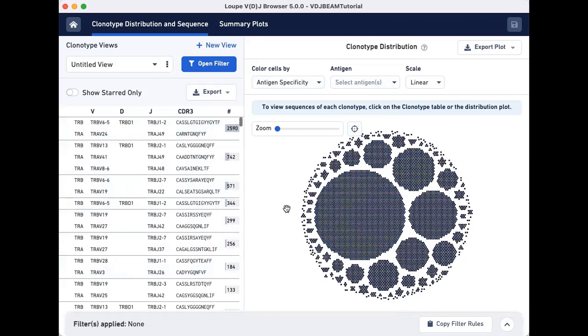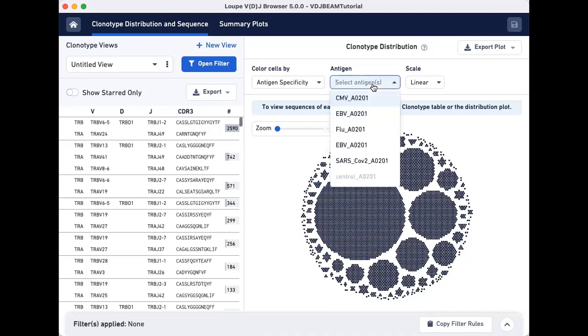First, we will color cells in the clonotype distribution plot by their SARS-CoV-2 antigen specificity scores. To do this, click on the Antigen drop-down menu located at the top of the clonotype distribution plot and select SARS-CoV-2 A0201.